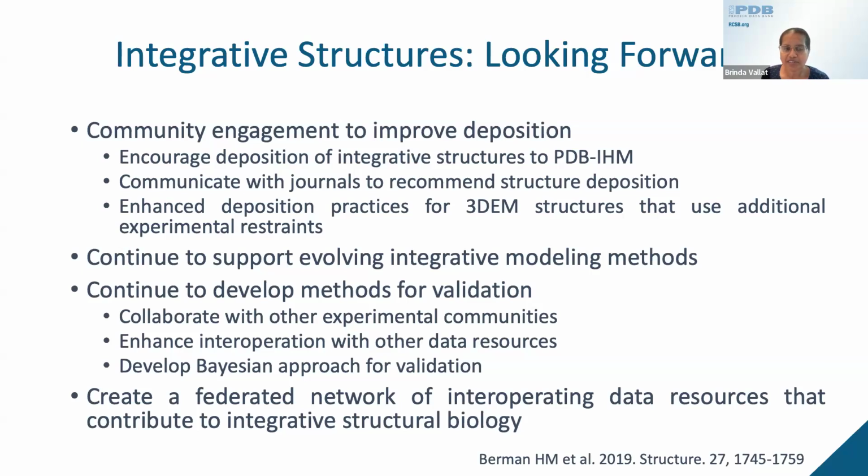We will also continue to develop validation methods and incorporate support for validating models based on other kinds of experimental data, in addition to SAS, cross-linking MS, and 3D-EM. We will work on improving the interoperation with other data resources to streamline access to pre-release data for structure validation. We're also working on developing Bayesian methods for structure validation applicable across different structure determination methods.